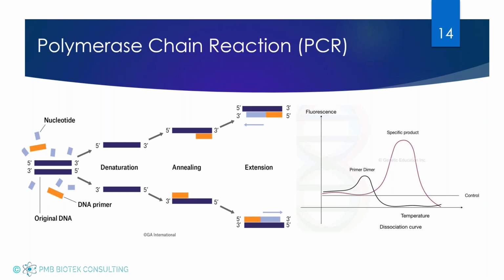In general, PCR is a pretty robust method, although it does have some tendencies where you can have inhibition based on compounds of the sample that you're evaluating. So while we view PCR, I think from a micro community, as the gold standard, there are still limitations, and that's why we're here today, because we're going to discuss that.